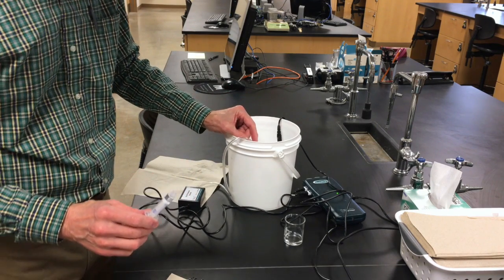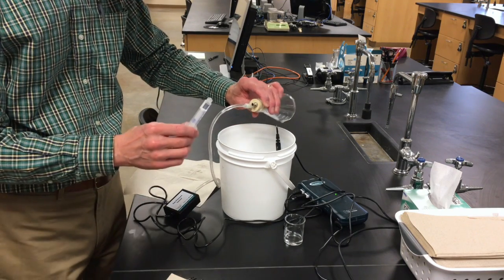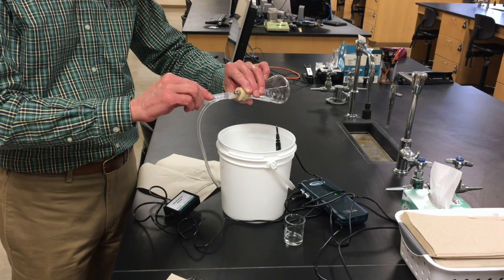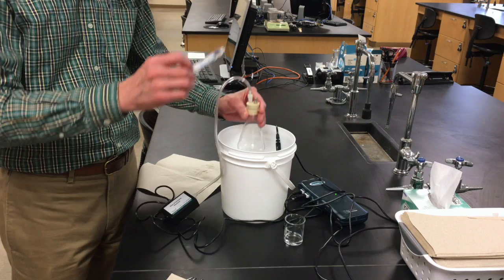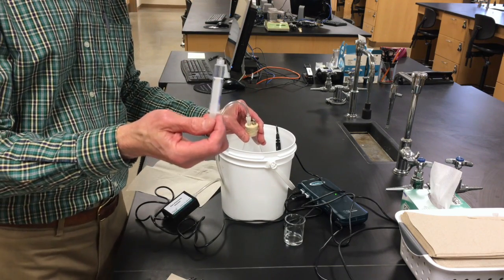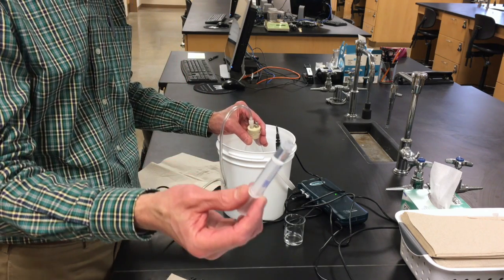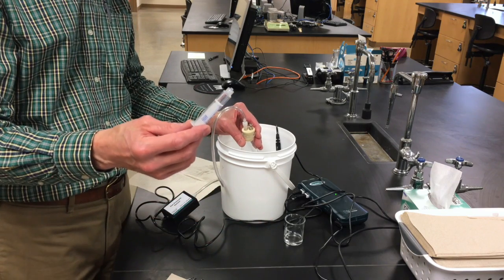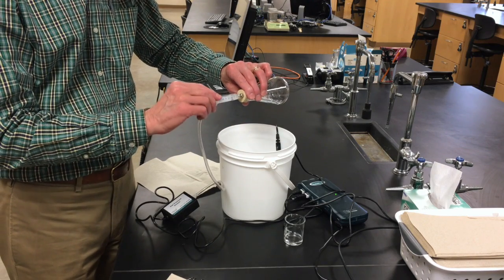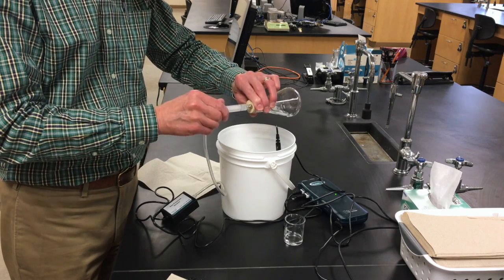And now we're ready to attach this to the flask. The way we do that is to tip the flask sideways. Take it out of the water bath, tip it sideways, and attach it this way. The reason for not going like this is that maybe you just saw a drip of ethanol come out of this. Some of the liquids have more or less vapor pressure than others, and they will dribble out if you turn them upside down. So turning it sideways like this, we can get it connected without losing liquid. And then screw it in.